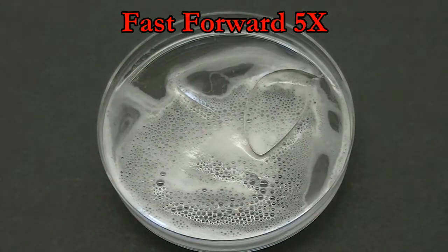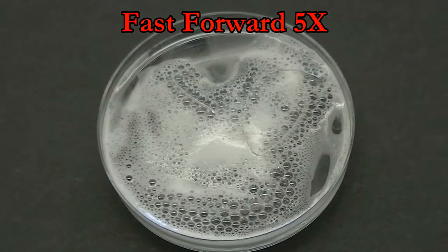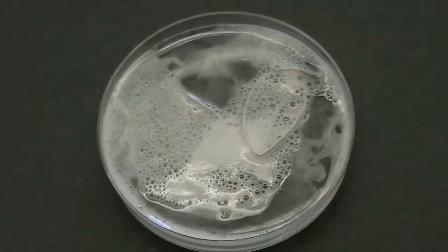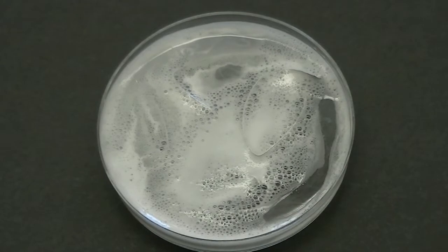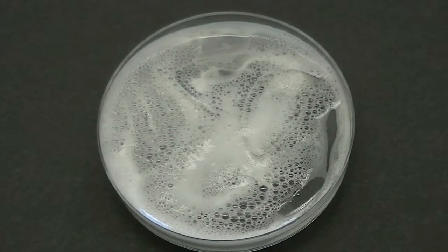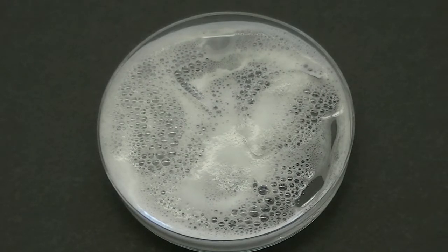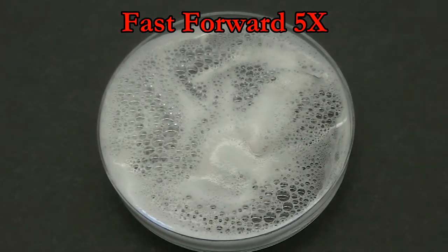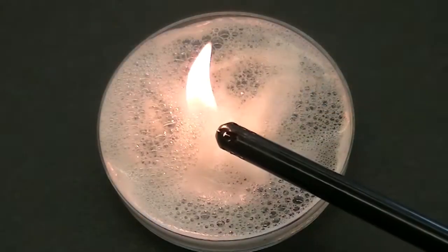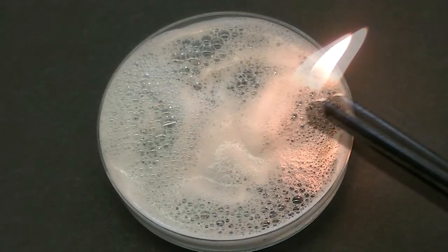Let's try adding more magnesium to get more hydrogen and a bigger pop. Now I'm going to let these bubbles build up for a long time to generate a lot of hydrogen gas bubbles to see how big of an explosion I can get. That wasn't too bad. Let's see that in slow motion.